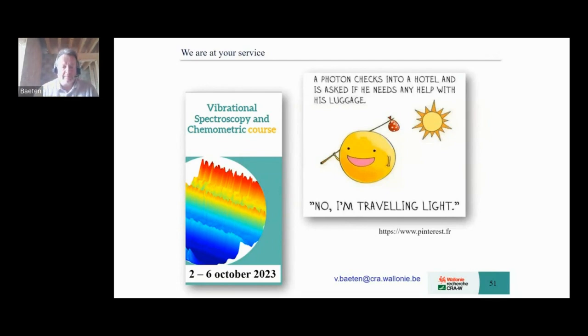Thank you, Vincent. For your next question, what are the challenges to implement a vibrational spectroscopy method? This is a very good question. Usually, I say that a spectrometer is not an espresso machine, because it's not because you put a coffee in it that you will get a good coffee. And so that's the same with vibrational spectroscopy.